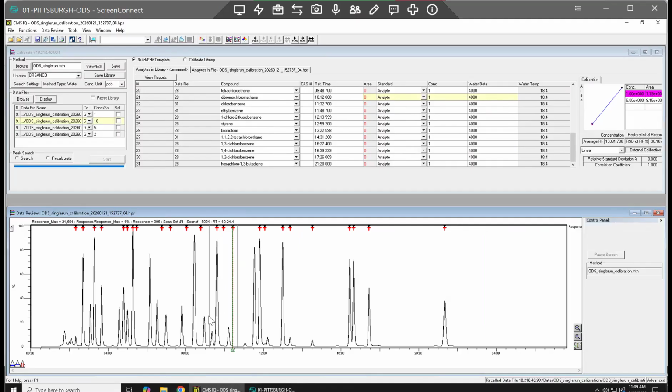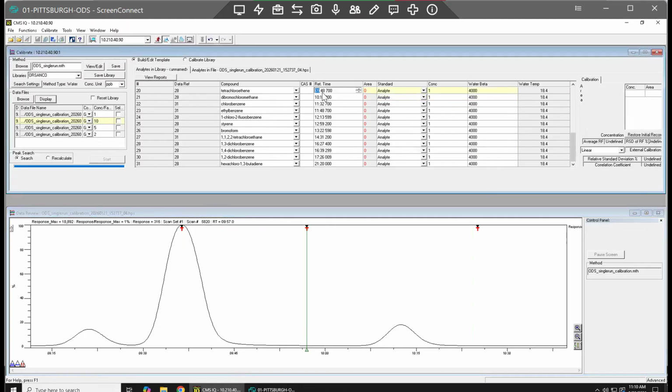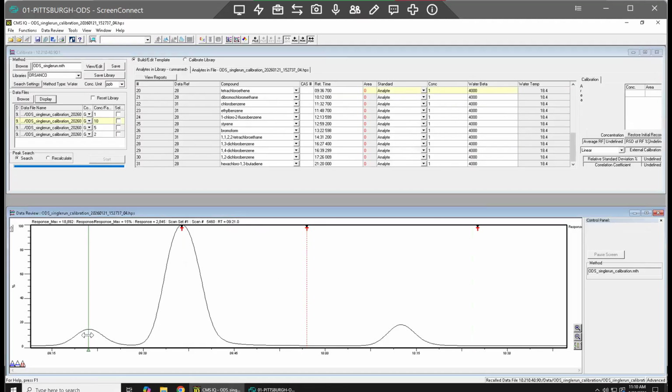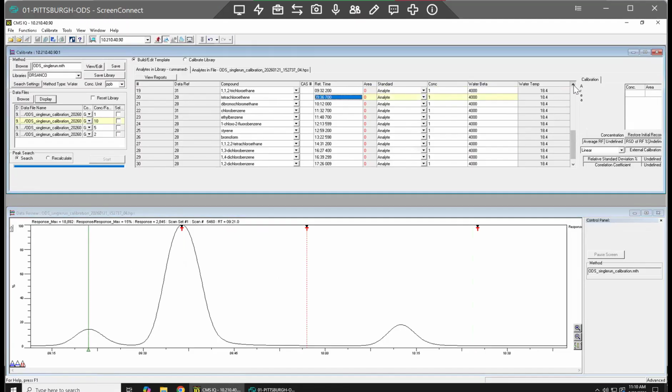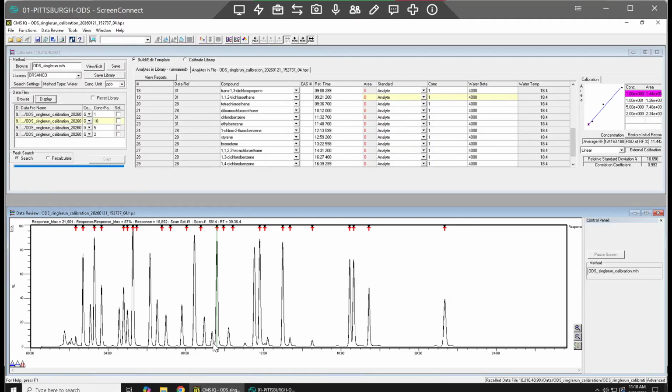Do a few of these. So we just did that one. Go to this next one. So before dibromo is tetrachloroethene, and it's probably the 936. And this guy should be 1,1,2-trichloroethane, so 932, but it is at 921. Okay, so back to the full screen. So we were on this guy. Let's highlight these three.